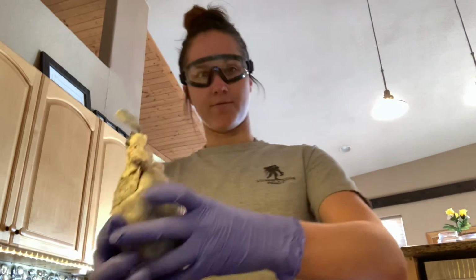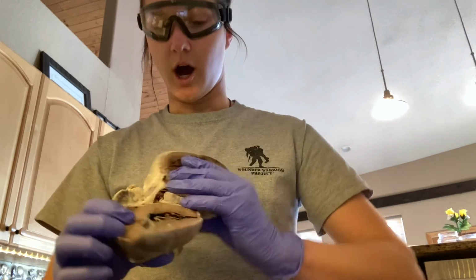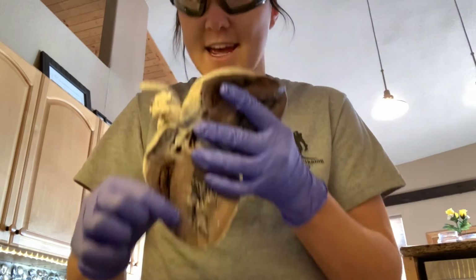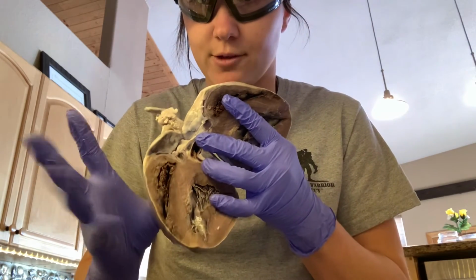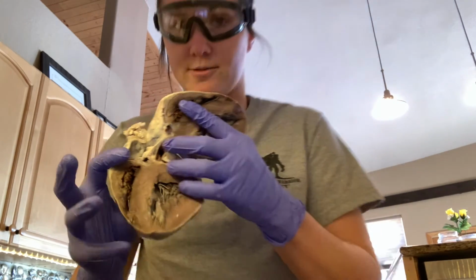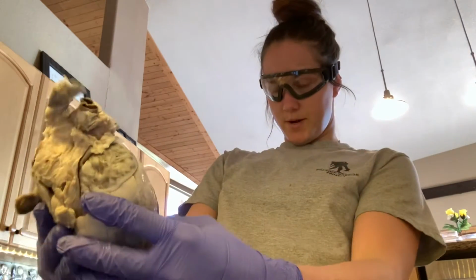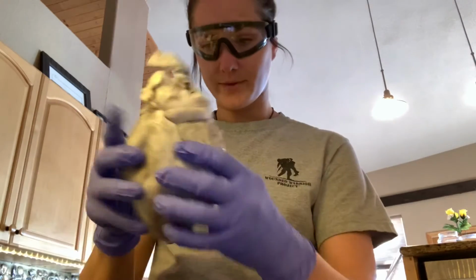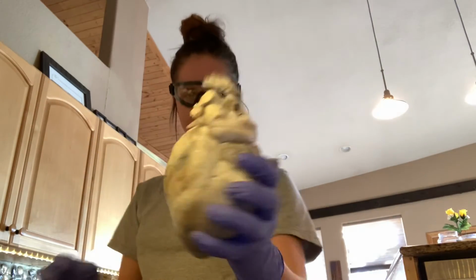All right, a few other things I want to touch on. This big chunk of heart meat here is the interventricular septum, and this separates the right side of the heart from the left side of the heart. And that's it for my presentation today. Hope you enjoyed the sheep heart dissection.